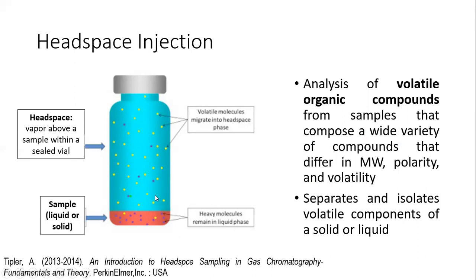You just need to place your liquid or solid sample in a sealed vial, and then it will be heated up to a certain temperature.